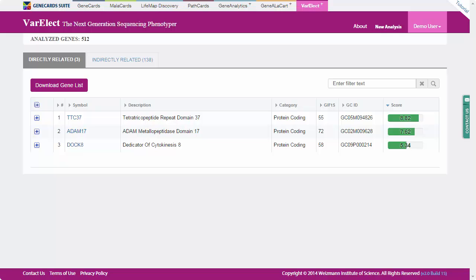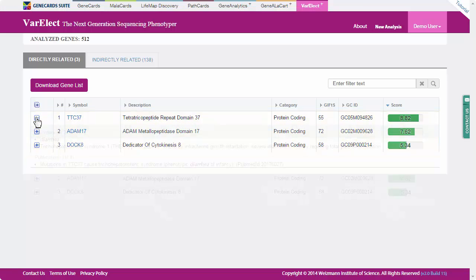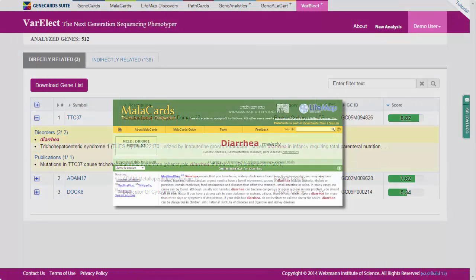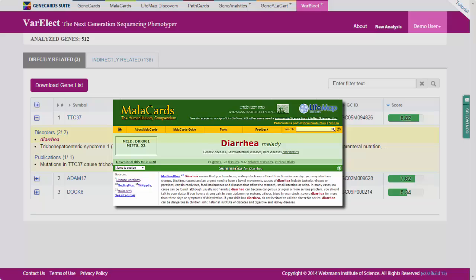Let's start with the directly related genes. In this example, three genes from our list are identified as directly associated with diarrhea. Expanding each result displays the evidence for the reported association. The detailed result for the first gene, TTC37, associates it with the phenotype of interest, diarrhea, via a publication that both appear in, as well as through a disease association reported by Malacards, The Human Disease Database.